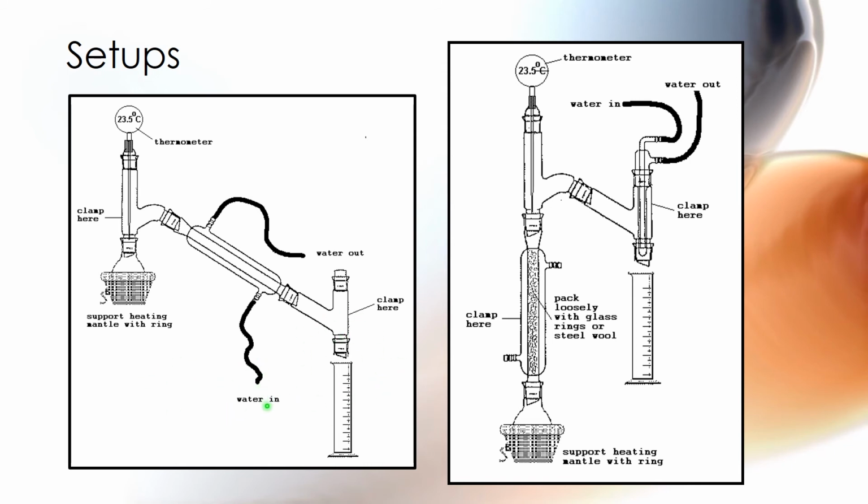Also, little tips to remember: when you plug in your water, make sure that the water inline goes into the slanted bottom part of the column and flows to the top, to the drain. That's really important. We always want to work against gravity when we fill the column. It prevents turbulent flows inside the column and helps it do its job a little bit more controlled.